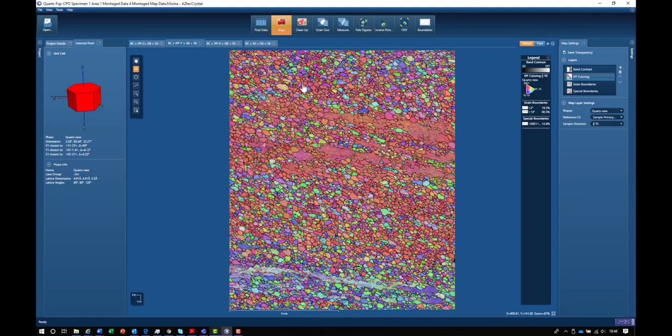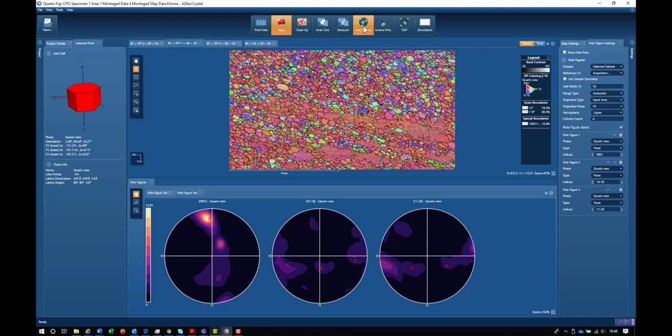Looking at the dominant red color allows us to interpret the crystallographic preferred orientation of this particular sample. When we look at the pole figure, it's no surprise to see a dominant cluster of C axis orientations close to the Y direction, as shown in the left-hand pole figure.